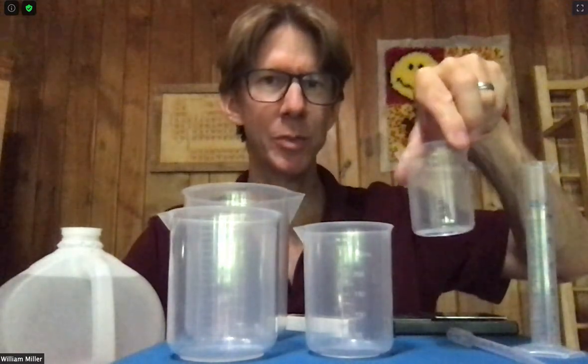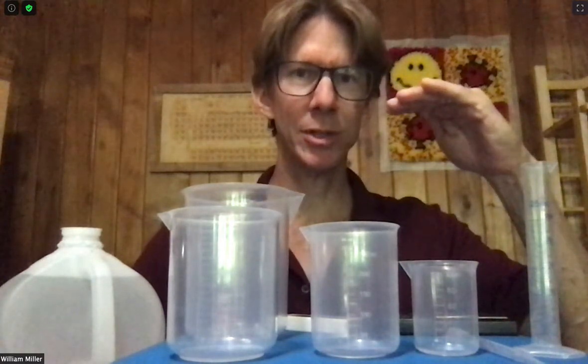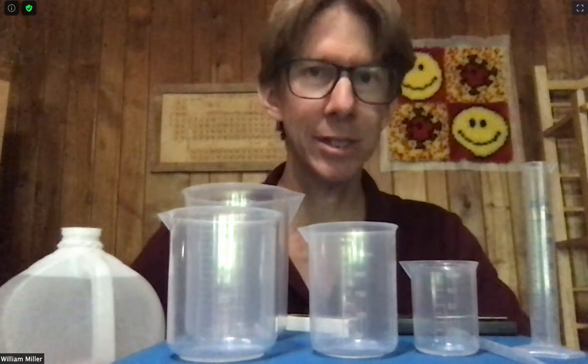You'll need a 100 milliliter beaker and a 250 milliliter beaker. Depending upon your 250 milliliter beaker, sometimes they only have markings up to 200. This one actually has markings to 300 milliliters, which technically makes it a 300 milliliter beaker, but something about that range.